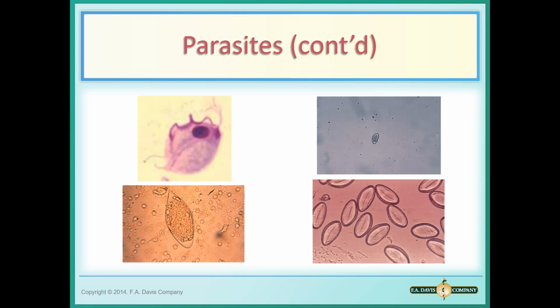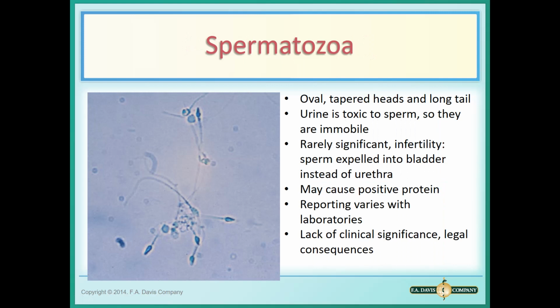Taking a look at them, you can see the pinworm eggs have a very, very distinct appearance. And you can see them. So if you see them in urine, they have a very distinct appearance, and they tend to be a little more refractile than a cell.